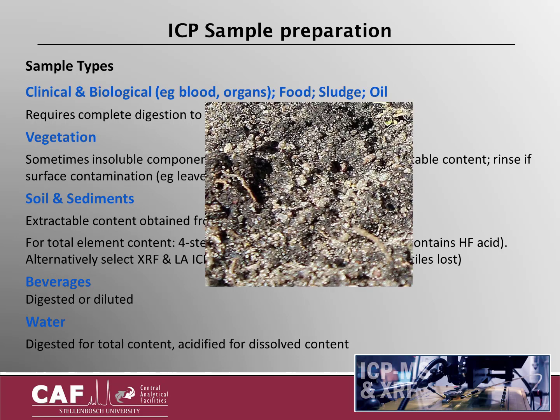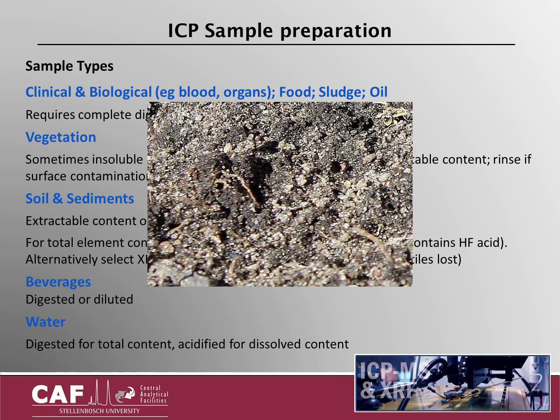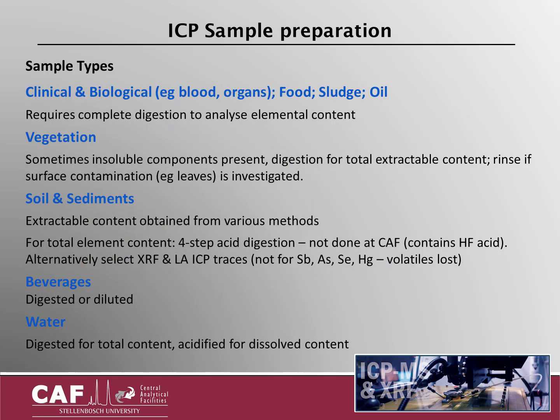For soils and sediments, you might either be looking at the extractable content or the total element content. For the extractable content, this can be obtained through various different ways, either by different extraction solutions or by microwave digestion.